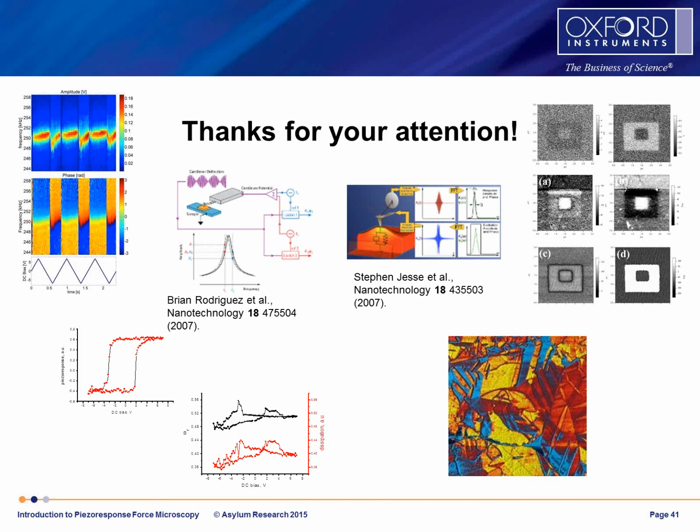Thanks, Roger. Sergey, a question for you. What about PFM measurements in ultra-high vacuum? Do DART and band excitation work under those conditions too? Yes.